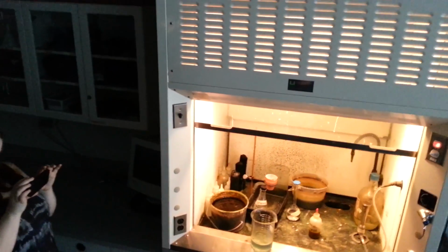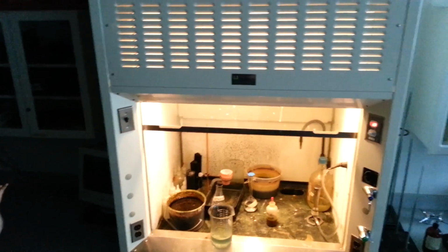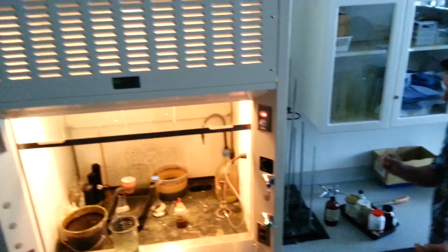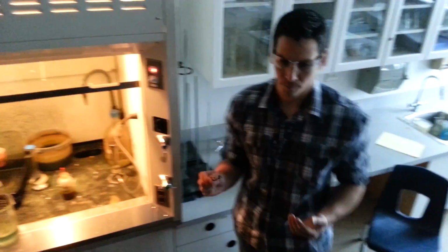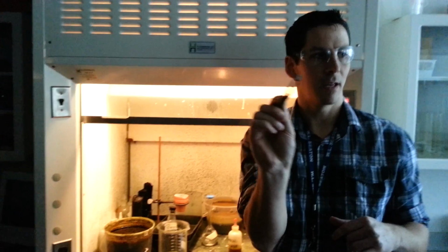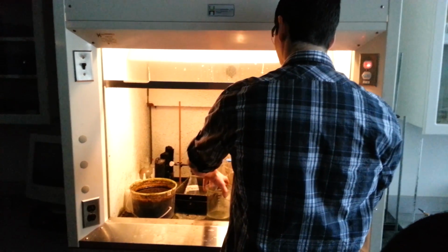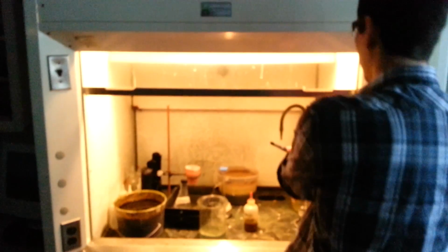Potassium is a very soft metal. Cutting it, it's about the same consistency as cutting tofu. This one's kind of purplish when it's oxidized, and then there's the cut shiny surface underneath. For this one, we're moving it back, and we're closing the fume hood. We'll turn off the light, because that'll make it more fun. Everything's better in the dark.